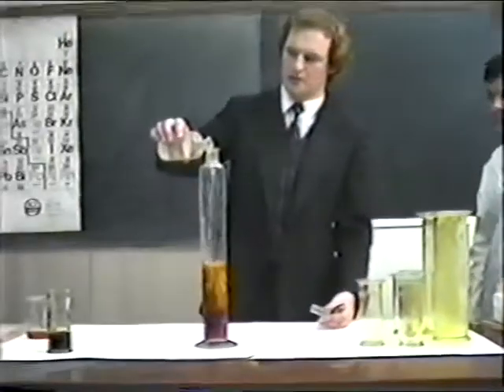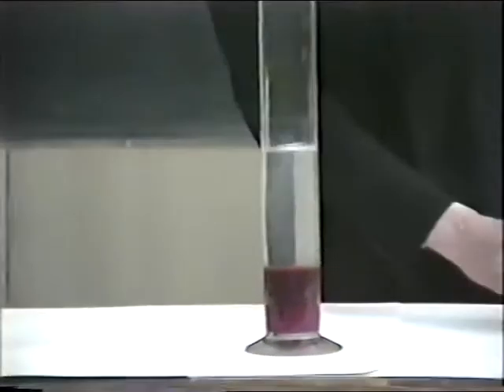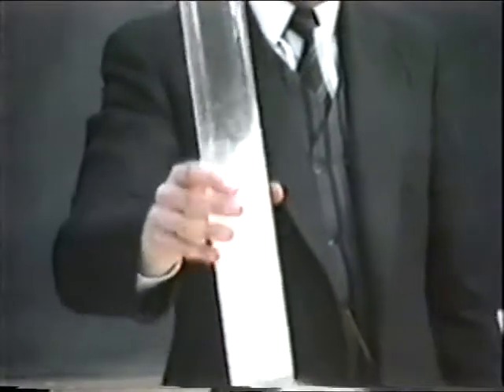This too can only occur with iodine. A little sodium thiosulfate solution there into the top. We stir up the mixture a few times and you will notice that the colour of the iodine disappears completely. This is another very useful test for iodine.